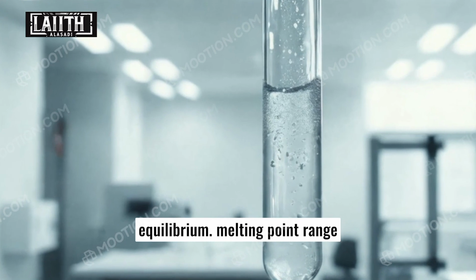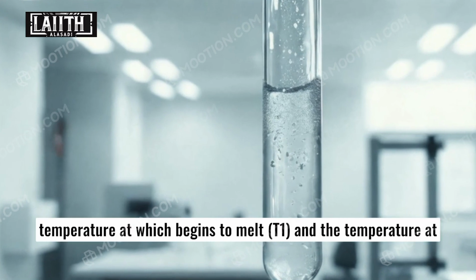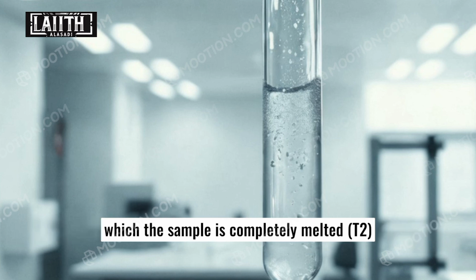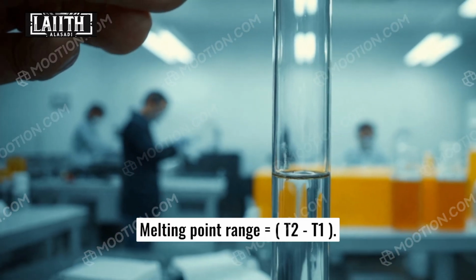Melting point range. The melting point range is the difference between the temperature at which the sample begins to melt, T1, and the temperature at which the sample is completely melted, T2. Melting point range equals T2 minus T1.